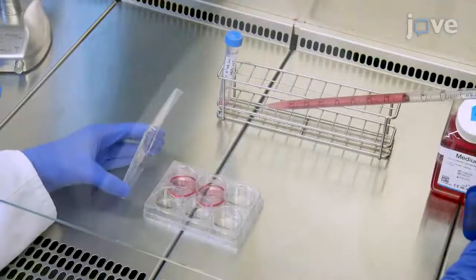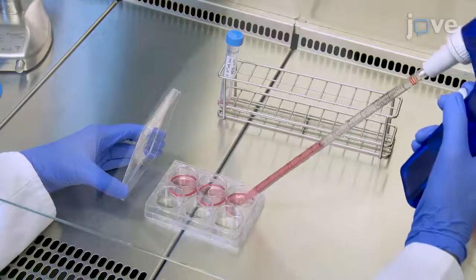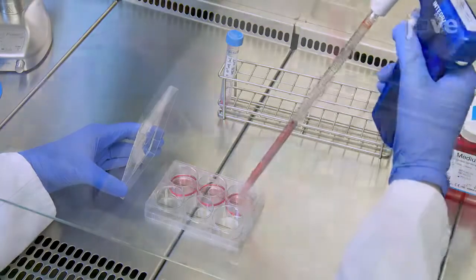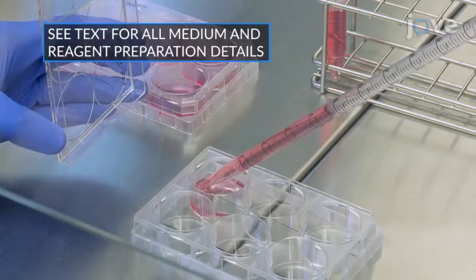Next, plate primary fibroblasts isolated from wild type and beta-3 deficient mice in a six-well plate at a 5 x 10⁵ fibroblasts per well concentration in 2 mL of DMEM supplemented with 10% fetal bovine serum.